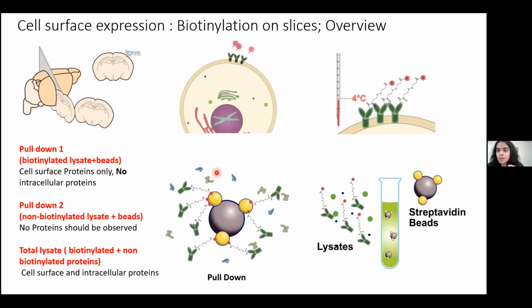So if we don't show all this, there's always a question of, well, is there a decrease in the protein levels? Is that why you're seeing the phenotype? Is the protein not trafficked to the cell surface? Is it similar to a knockout? Is it not expressed in the axons? So to prove the point that we're trying to prove, we had to do all these experiments. It depends on what you're trying to answer.